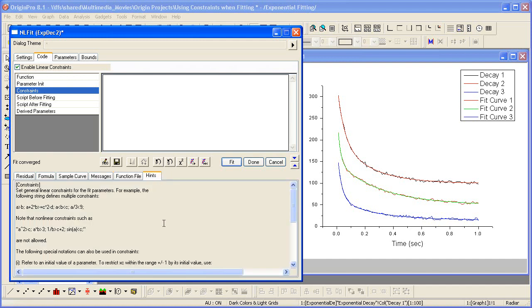If I wish to constrain all the T1 parameters to be greater than 0.2, I enter the following: T1 in parentheses A for all greater than the value 0.2.